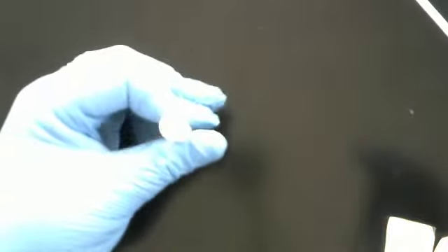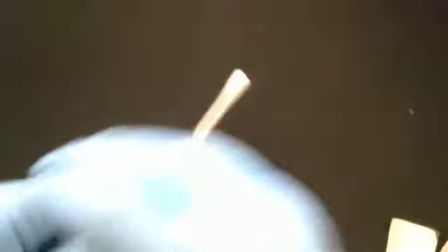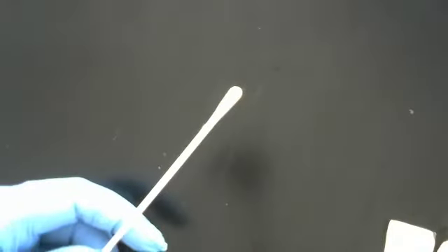Then we're going to need to take our oxidase reagent, break a little tubule inside. There we go. And then we're going to drop our reagent onto it, and within 5 seconds there should be a positive or negative result.